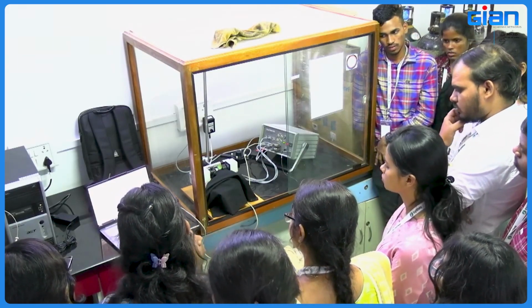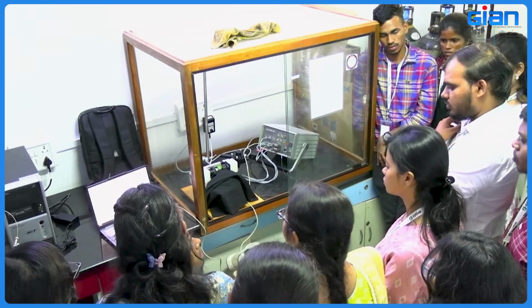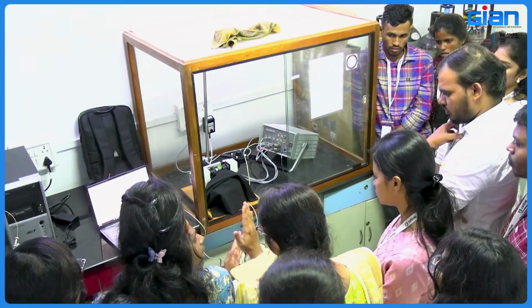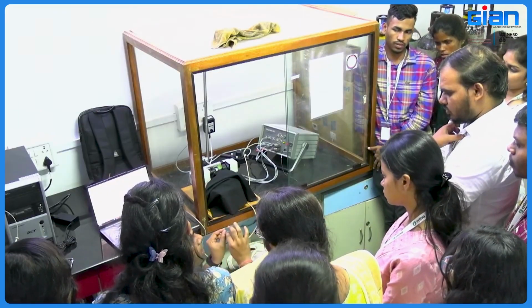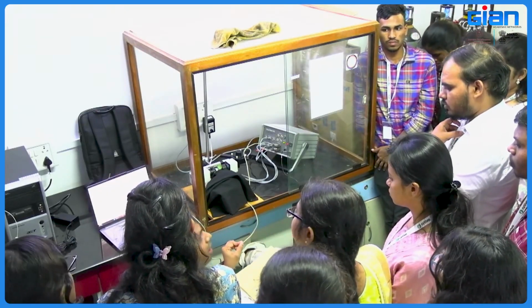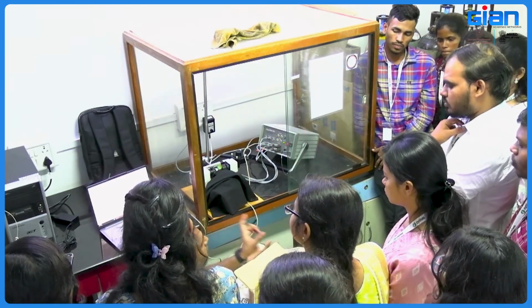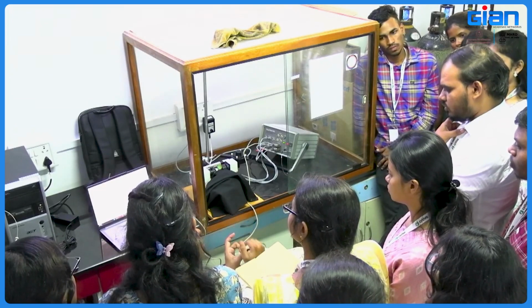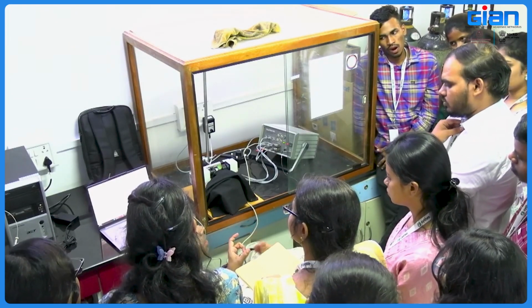Only 30 seconds. You can also go lower: 10 seconds, it depends, but the average protocol is 30 seconds. After 30 seconds, again a saturating pulse to record a point, then a higher light intensity for 30 seconds. So you are increasingly incrementing the PAR intensities, and with that, the quantity of reduced reaction centers is increasing.